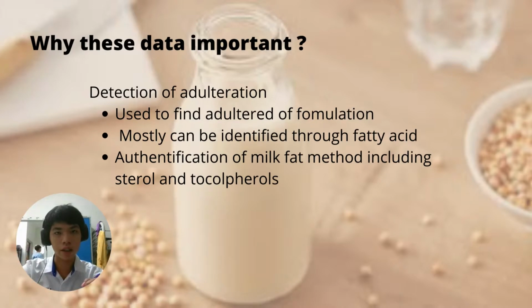It is also used to detect adulteration, because now in the market there is a lot of adulteration of milk, where they use other components like palm oil or other palmitic oil. Some also use non-edible oil like castor oil to adulterate good oil like butter or olive oil.